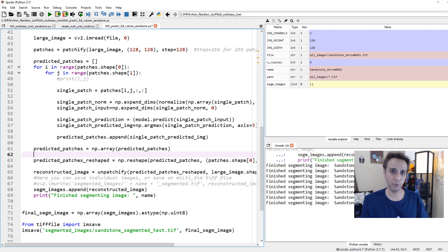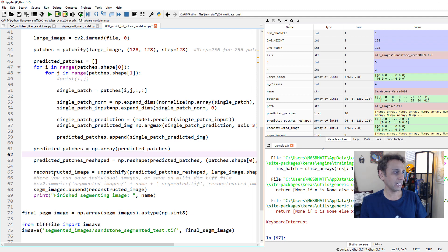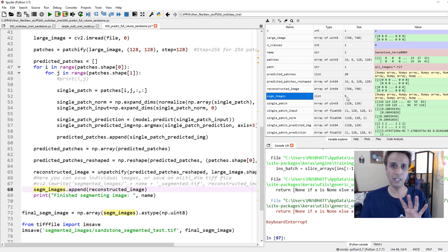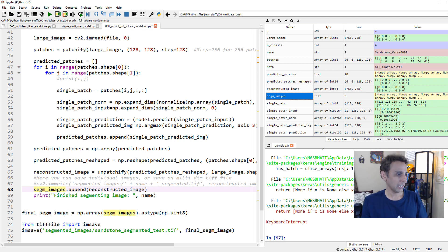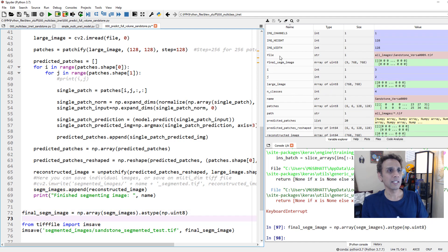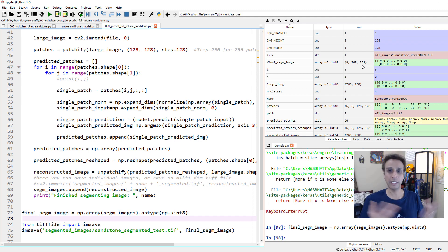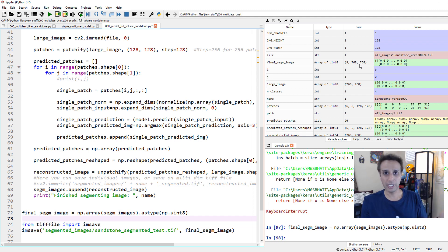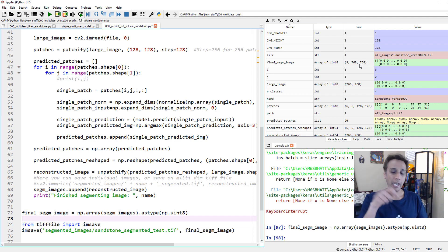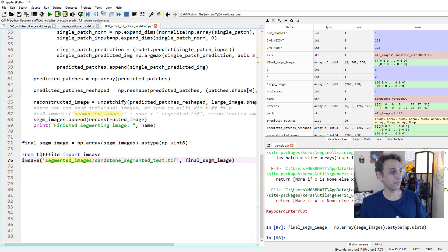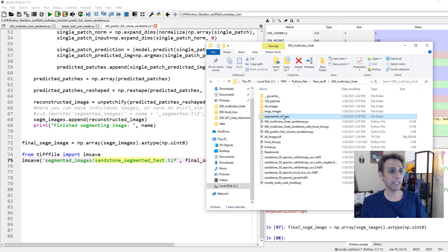After processing, segmented images is a list. I convert it to a numpy array to get the final segmented image - nine images of 768 by 768 in this run. You can also write each image to a folder with the original name plus a 'segmented' suffix. I'm also importing the tifffile library to save everything as a single 3D TIFF file.